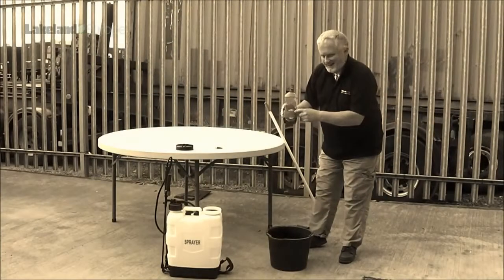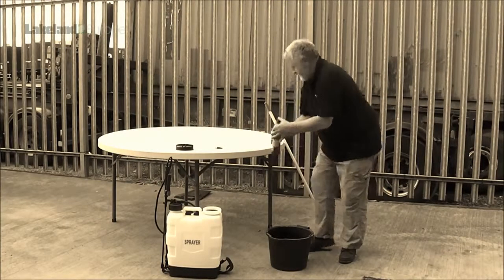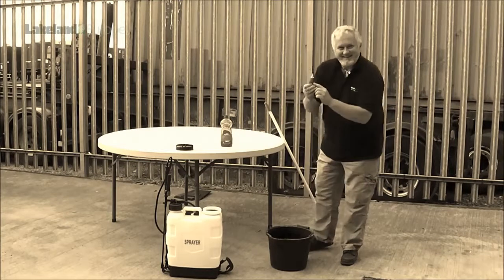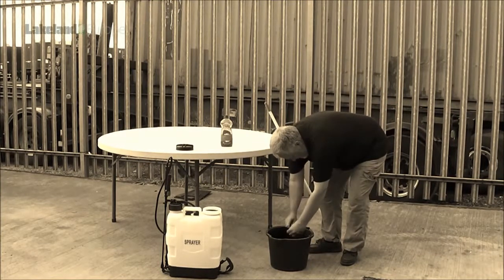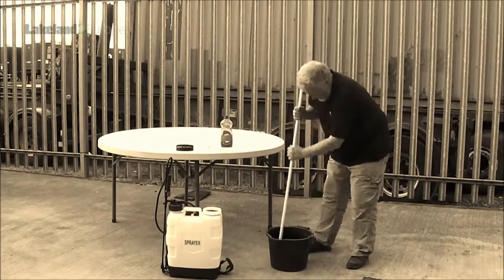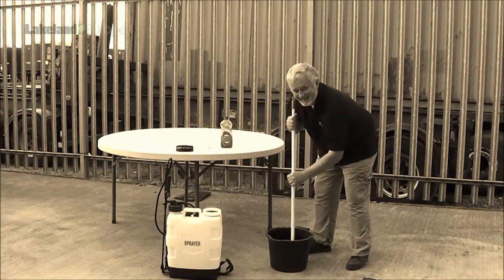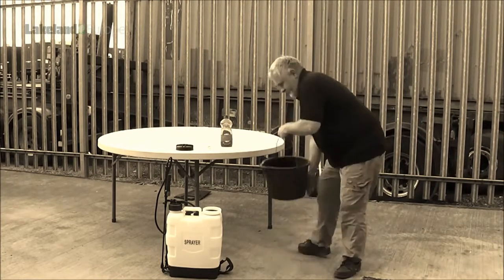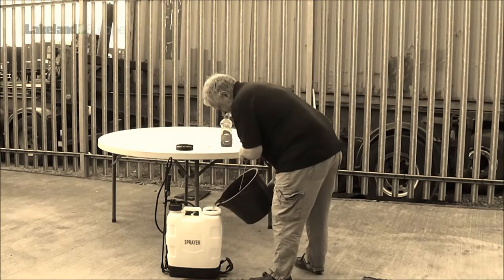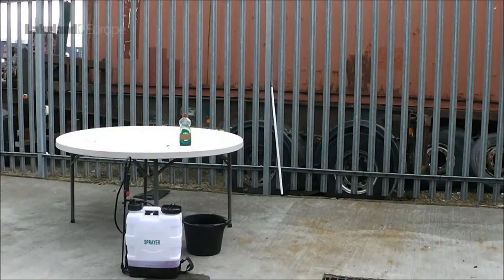First, we added some detergent to a bucket of water. Then we added red food dye, just to make sure that if the liquid did penetrate, we would see it clearly. The detergent reduces the surface tension of the liquid, increasing the likelihood that it will find any gaps in the join between sleeve and glove. Having mixed the liquid thoroughly, it was added to the jetpack.